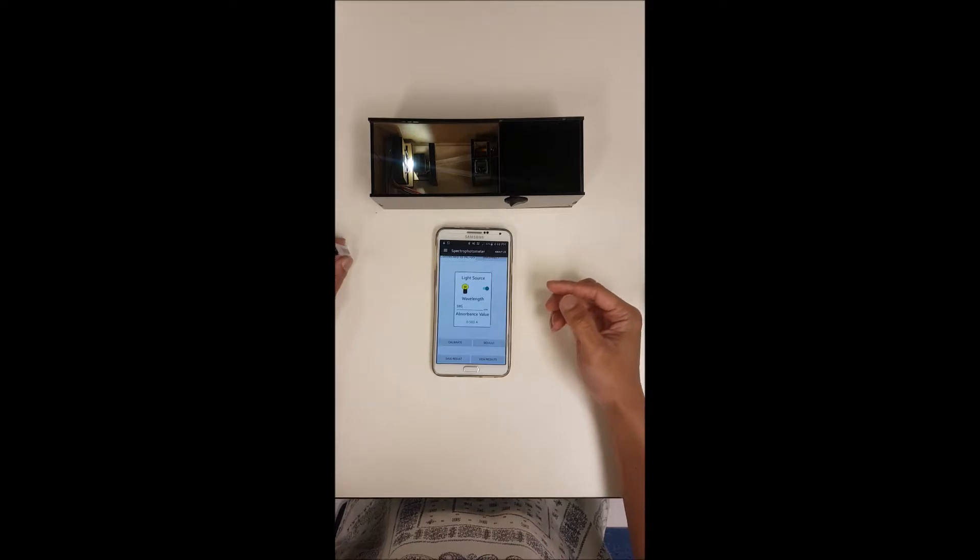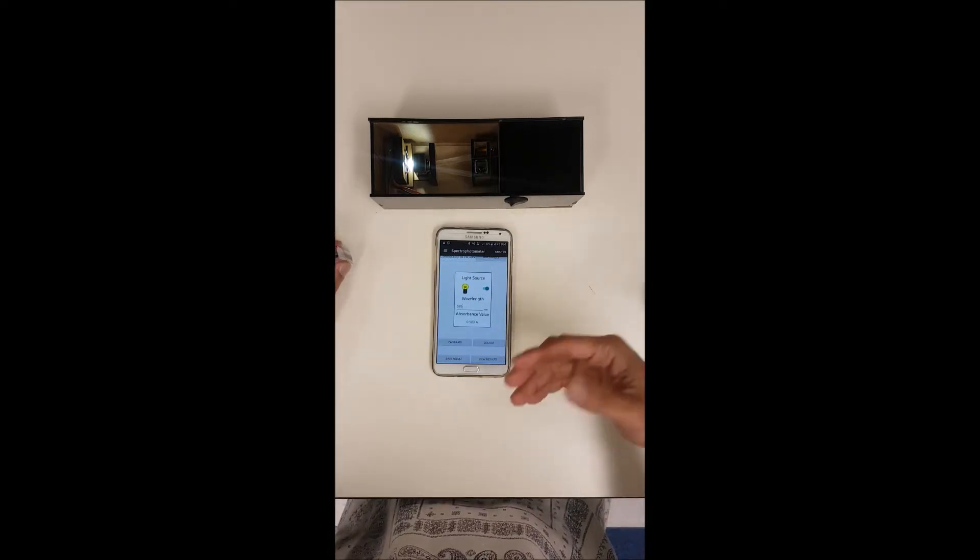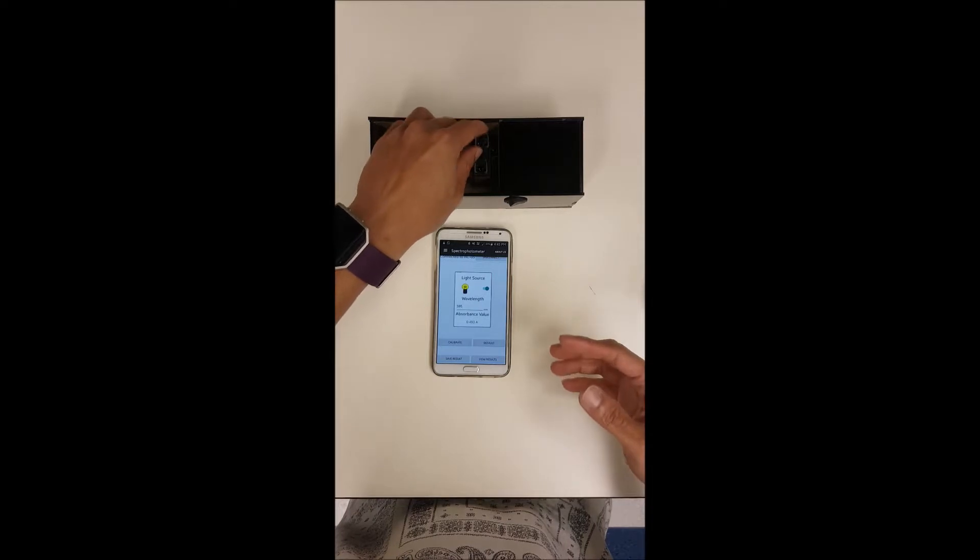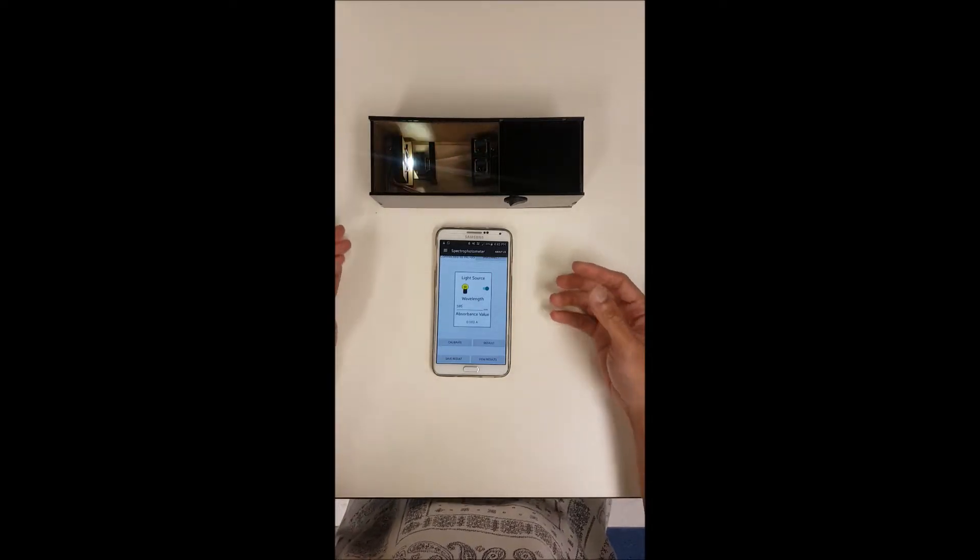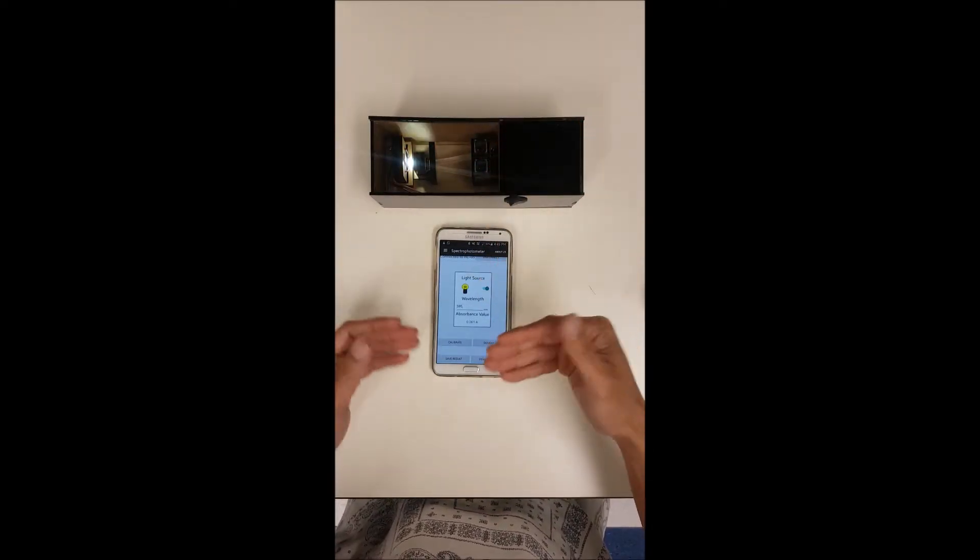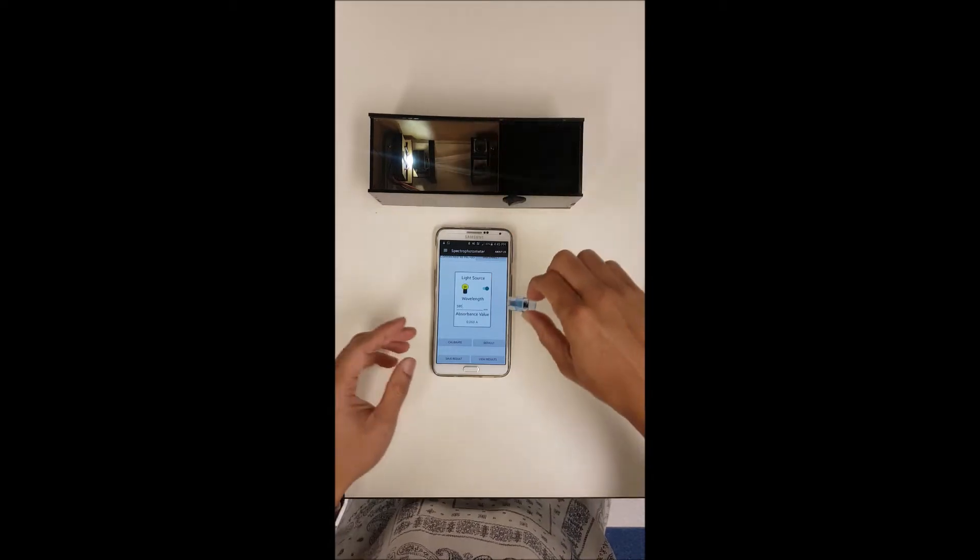Here you can see that you can have a time-based colorimetric assay where you can leave your blank in as you change your samples at the bottom.